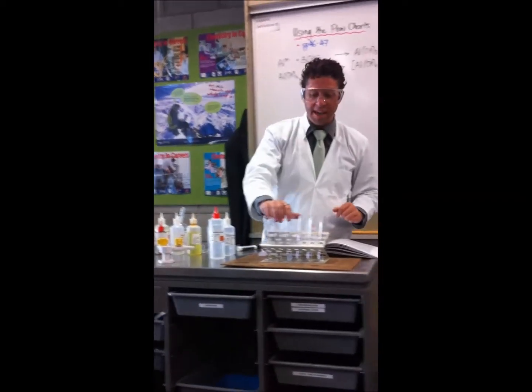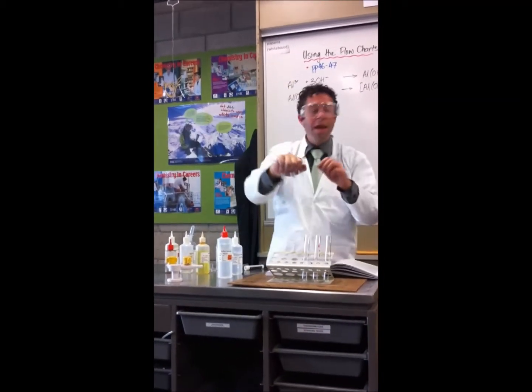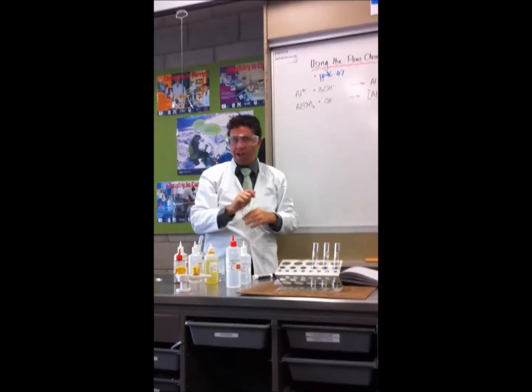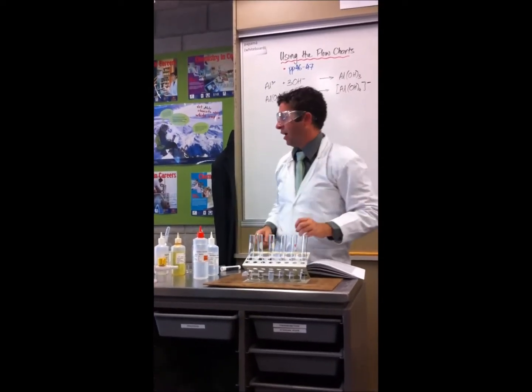Alright, so you can see I've had to do 3 different test tubes, 3 different sets of results to prove that that is aluminium, but I've only needed 2 equations for that because there was only really 2 changes. Alright, right, I'm going to show you a different one. I'm going to show you one where there is a coloured ion.